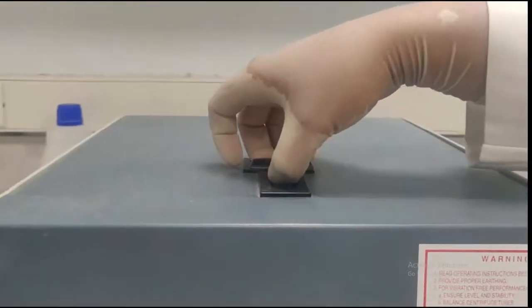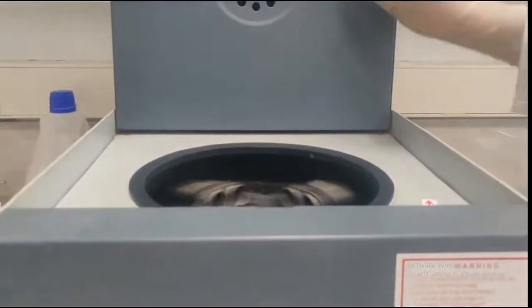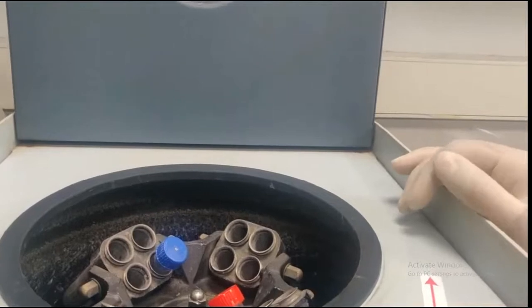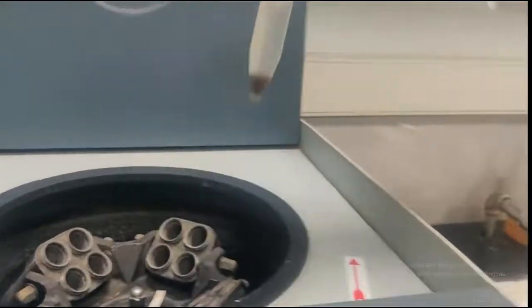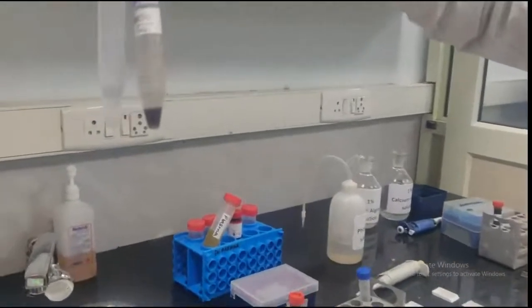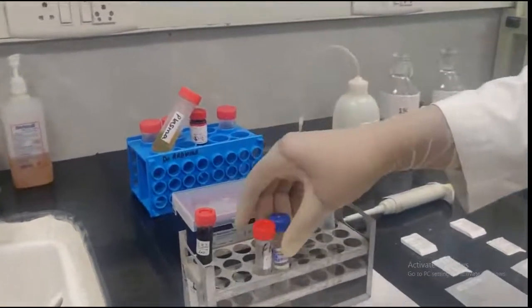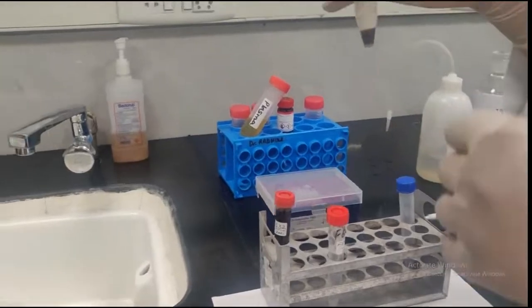So now the centrifugation step is over. The tubes will now be taken out. You can see there are nice pellets at the bottom. So now this washing step has to be repeated again. This will be the second washing. Again the supernatant will be discarded.